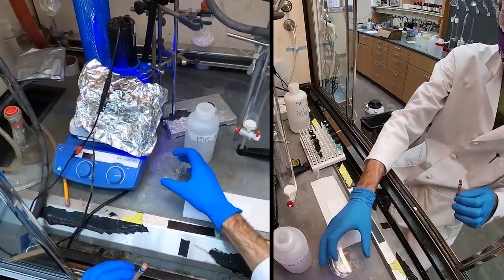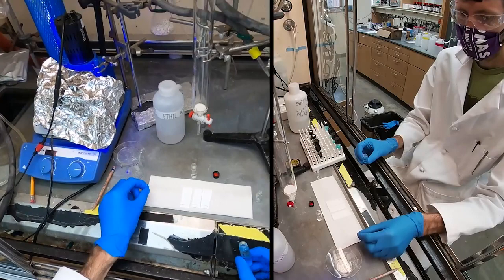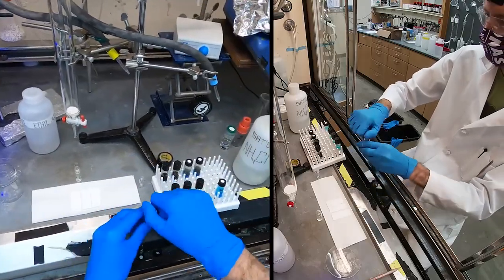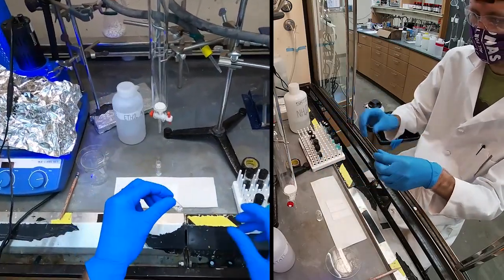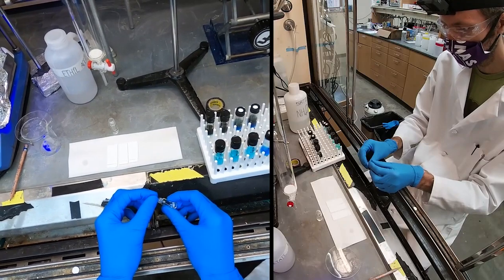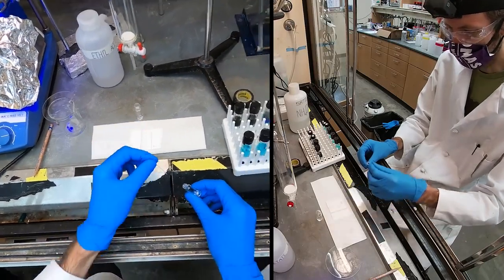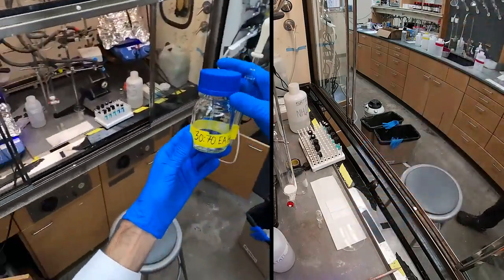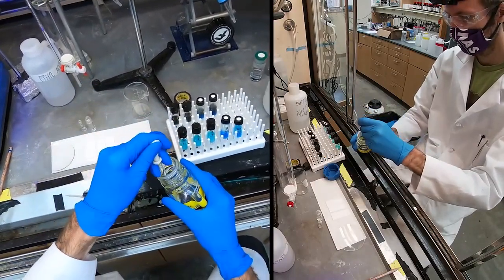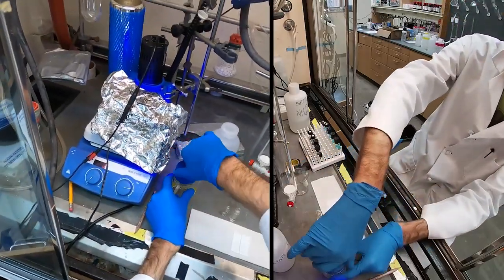Got my development chamber right here. Got a spotter. So we're doing 3 plates and 3 lanes. The middle lane is going to be a mixed spot between the starting material here and the reaction. The rightmost lane is going to be just the reaction, and the leftmost lane is going to be the starting material by itself. We'll start off here with 30% ethyl acetate in hexane, and we'll just see what that looks like. So let that run, close this up.